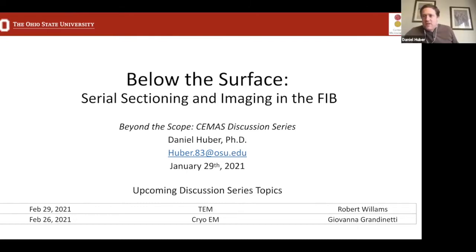Well, thanks for the introduction, Dan. We want to talk about some serial sectioning and imaging in the FIB today. It's one of my favorite things to talk about.